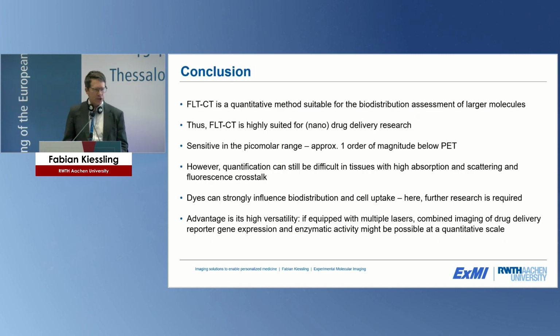This is already what I wanted to show you in my short presentation. I hope I could convince you that FLT-CT is a quantitative method suitable for biodistribution assessment of larger molecules. I think it's a very valuable tool for drug delivery research and for research on any kind of nanomedicines. It is indeed sensitive in the picomolar range, in our measurements just about 1 order of magnitude below PET in sensitivity. However, we need to admit that in some organs and regions, you still have problems with fluorescent crosstalk between organs. If there is a high discrepancy between the tissues in scattering and absorption, sometimes quantification is a little bit more difficult.